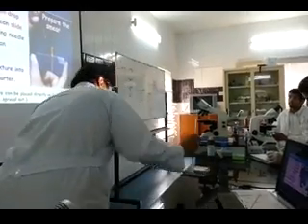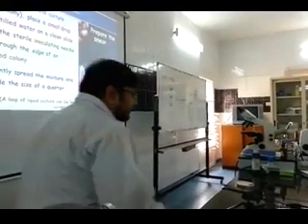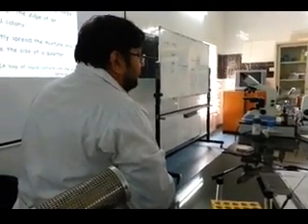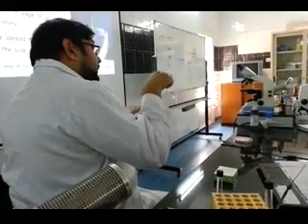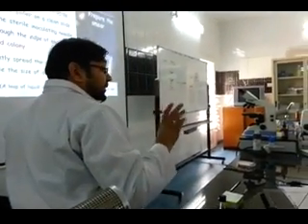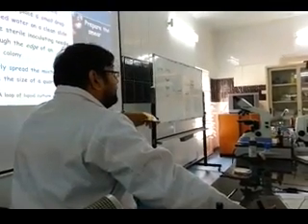So you can have liquid culture and you can have solid culture. So what you do, you sterilize your loop depending on what you have. If you have solid culture, you take one slide and put a drop of distilled water on it. Okay? I'll show you how to do it. You take one slide, put a drop of distilled water, take one colony and mix. When you mix, make it big like this, one part of the smear is done. You got it? You sterilize your loop, you put one drop of distilled water and you mix the colony.